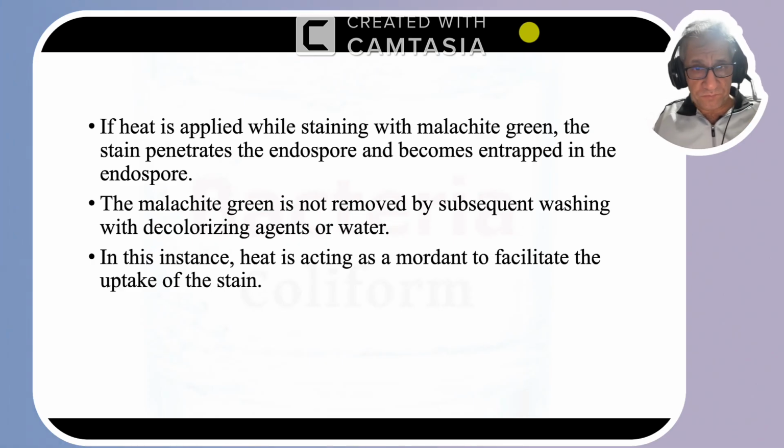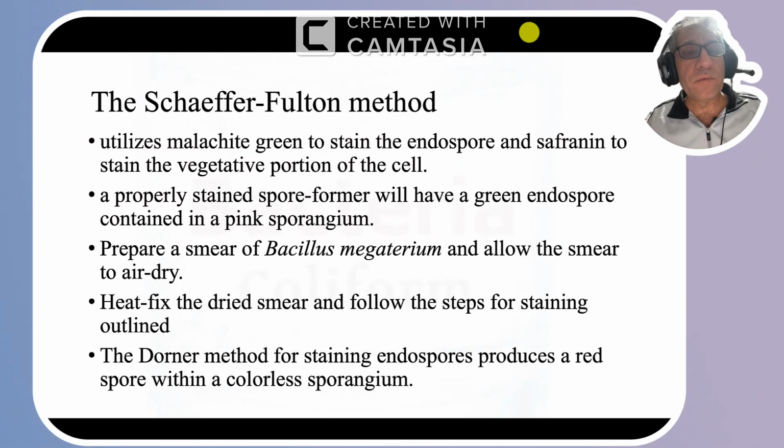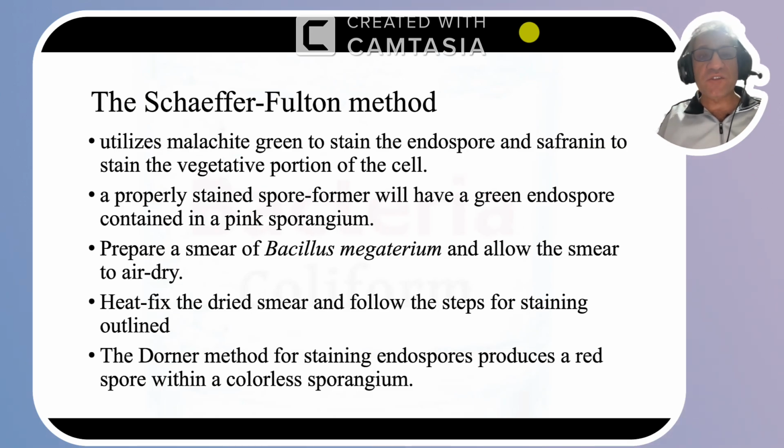So in our test, look, we have three materials, of course: malachite green, safranin, and water or decolorizing solution.